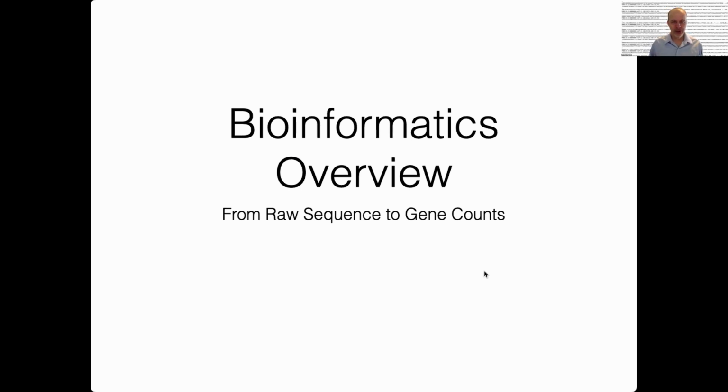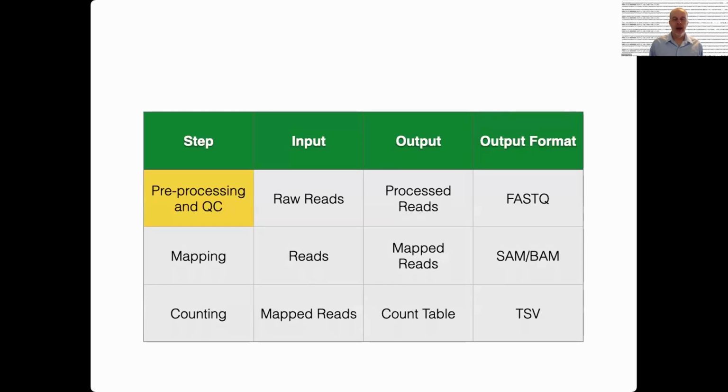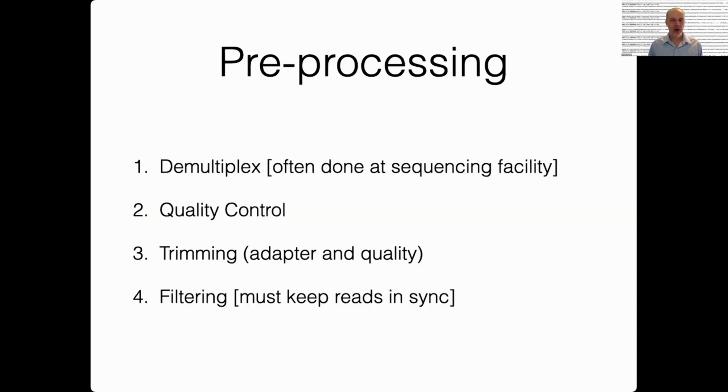So just to introduce you to the FASTQ file. That's both the input and the output for the first step, which is pre-processing quality control. Here's a quick summary of what the pre-processing is.